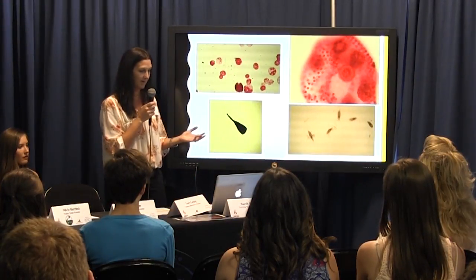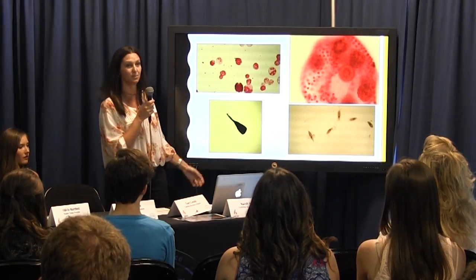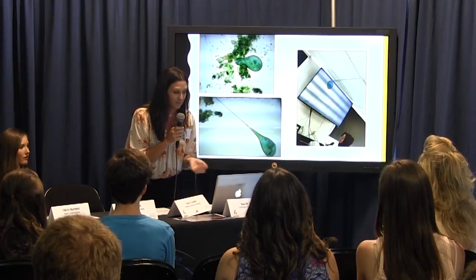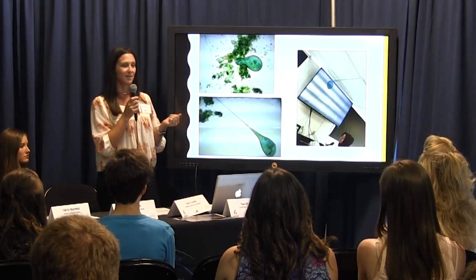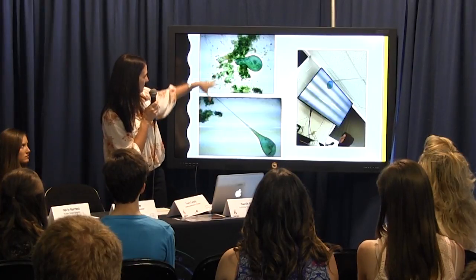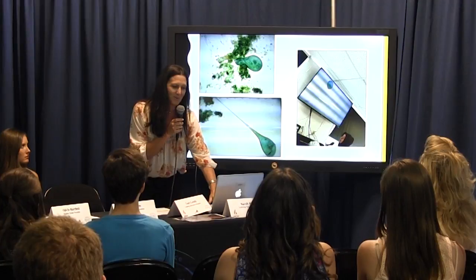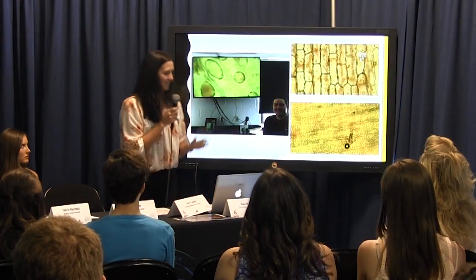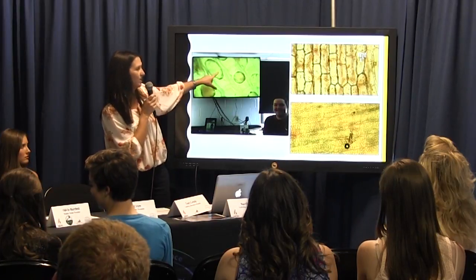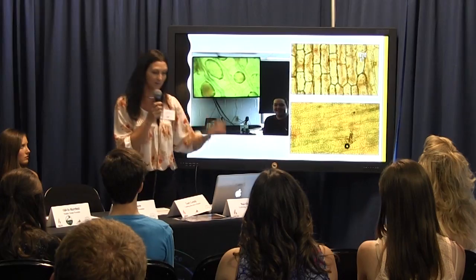So those were prepared slides already. So here's some more. These were just some really good Stentor, Volvox, Euglena. And then we worked with living organisms, and here was Stentor, and these were different stages, and they did some screen captures. He looks real enthused there, but we were doing some stuff like that. Some more with plant cells. In this one, she added salt water to it to watch the cell membrane shrink. So we got some good stuff.